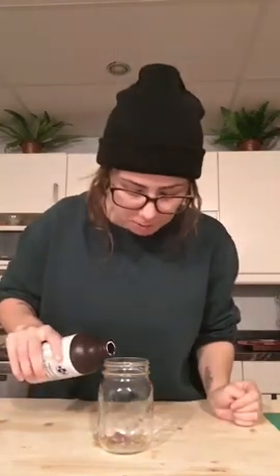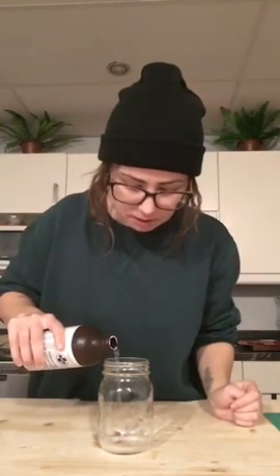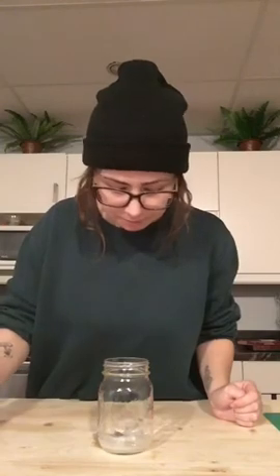Alright, so this is my liver that was in warm water for 10 minutes. And I'm going to add hydrogen peroxide to that. And we have a little bit of a reaction. Not a lot. I'd say that's a 2. As you can see.